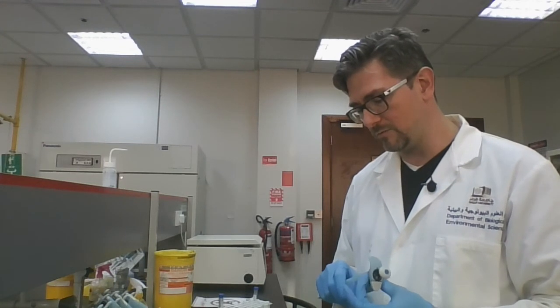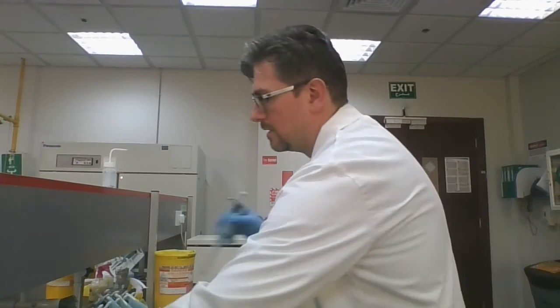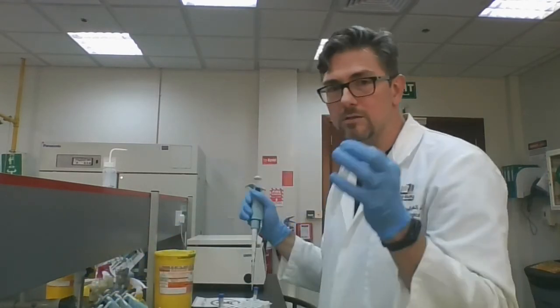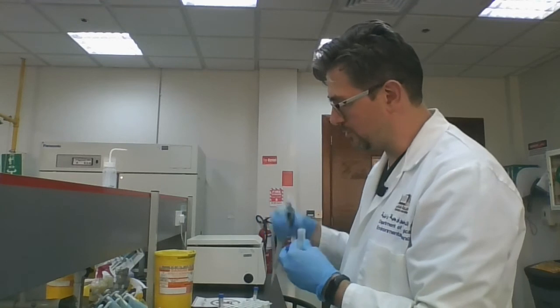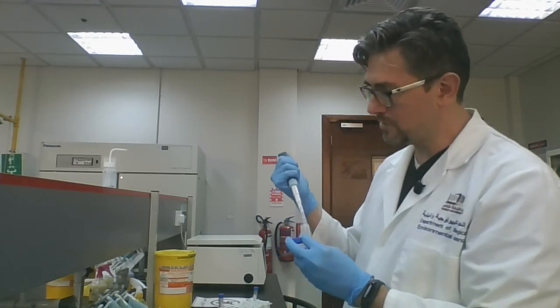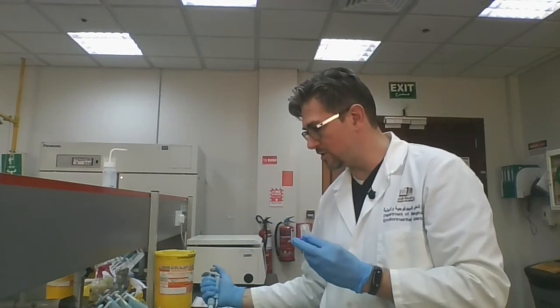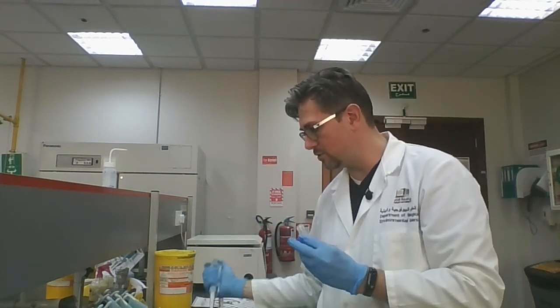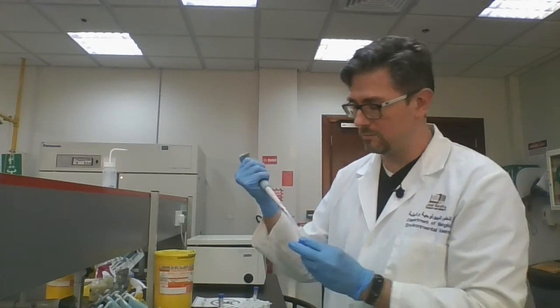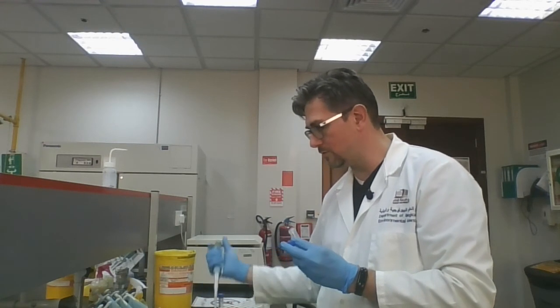I will set my P1000 this time to 700 microliters. And I will add 100% ethanol into this. So I'm going to add that to both of my epitubes. That's going to be getting very close to the top of the epitube. So you're going to get very close to the limit of what this epitube can hold. Just keep that in mind. But don't be afraid. You should be able to fairly easily squeeze in 1.5 mLs. So putting in an extra 700 microliters shouldn't be a problem. You can have just a little bit over 1 mL in here.